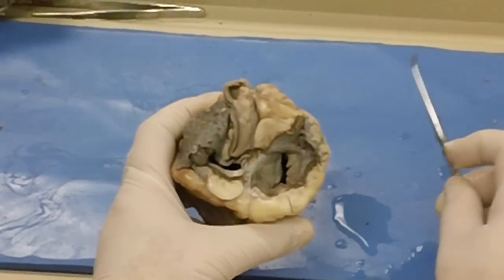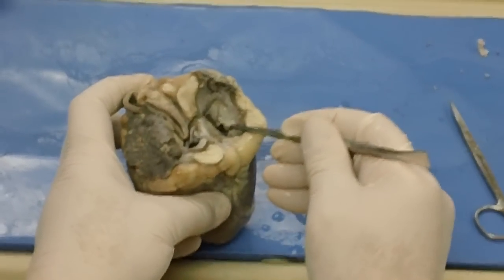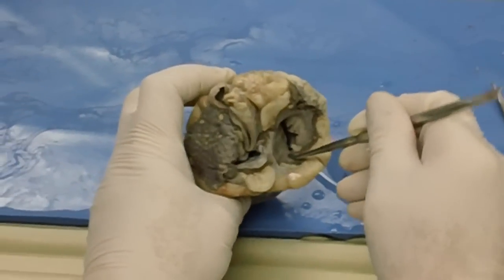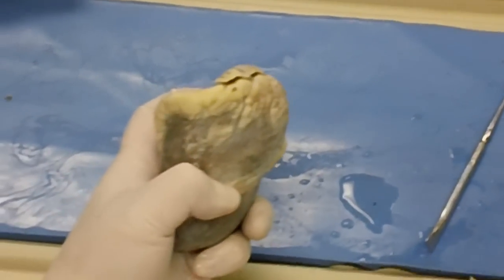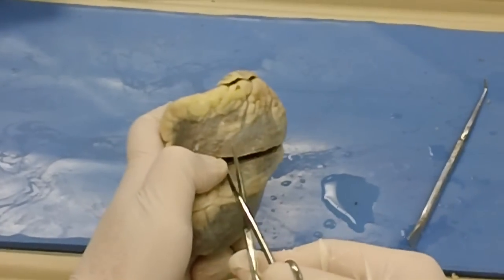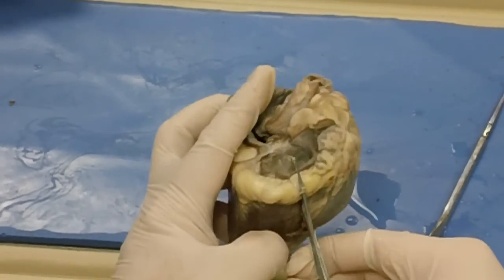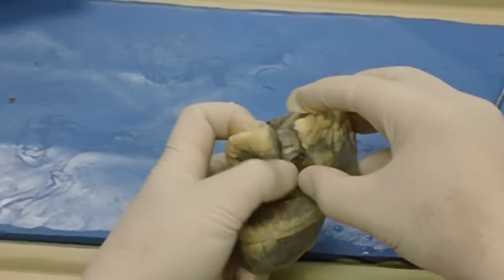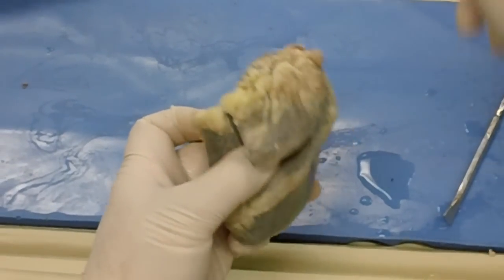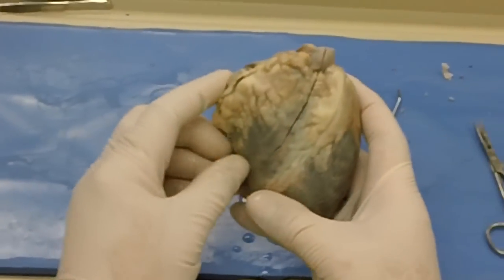So that means that the valve that we were looking at from under here is right here. There's the tricuspid valve leaflets right there. It's actually a nice view of it. So, to finish the cut, now we would go this direction. Yeah, that's close enough. Like that. And so you can see a V cut right there. The direction of blood flow then would be in here and out there on the right side of the heart. So that's the right side of the heart.